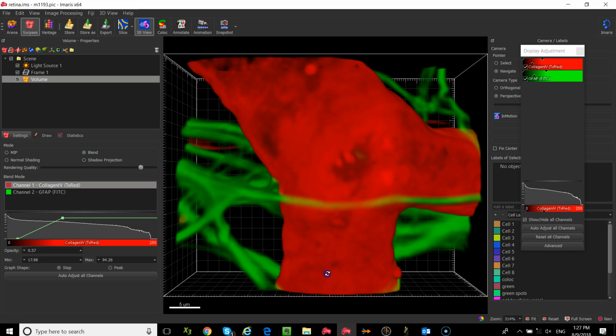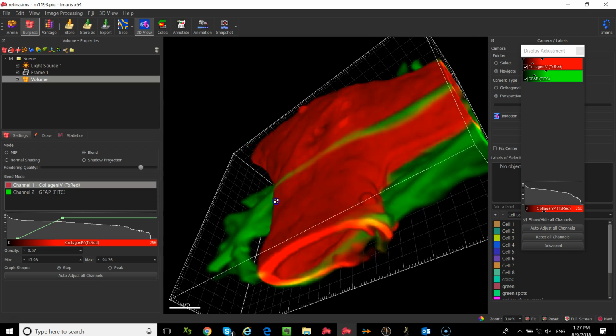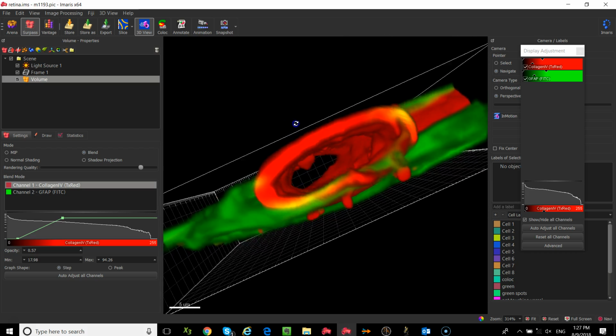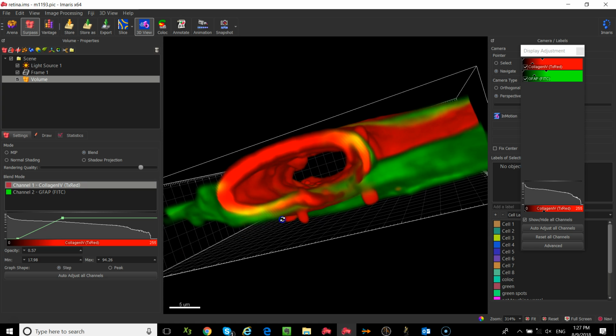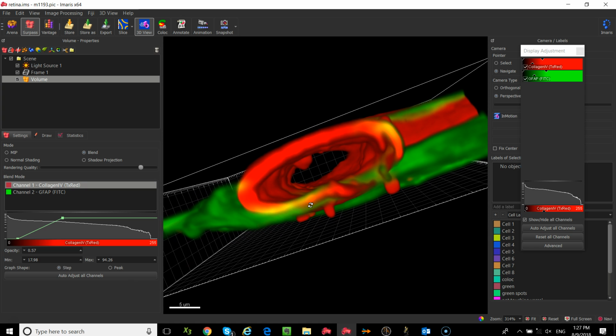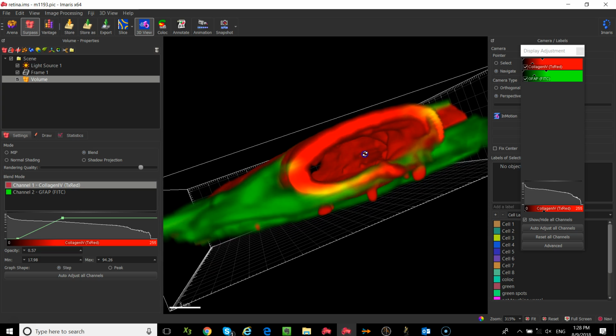Now, as I said, this is now a blend reconstruction. So if you click on your 3D view and move it, you'll be able to move and reorient that data from whatever direction you would like. If possible, I'd like you to orient it so that you're looking through the vessel, kind of like what I'm doing right here. And this is a great example of why blend rendering for 3D is so useful. Do you see, if you look inside the vessel, those lumps and bumps inside?